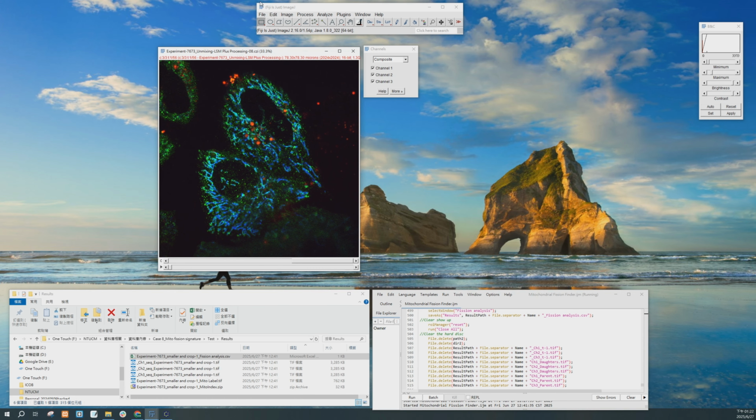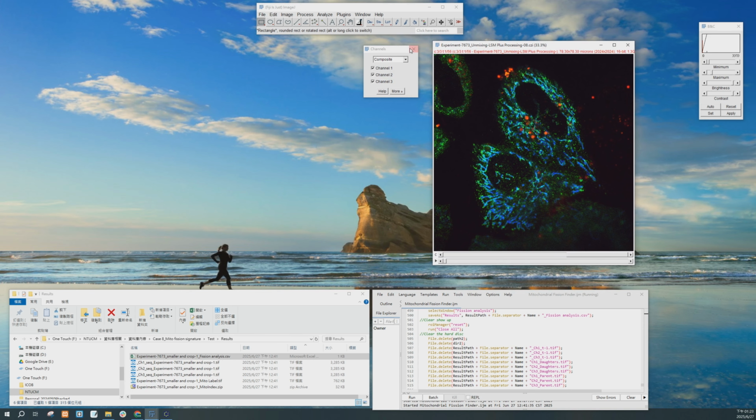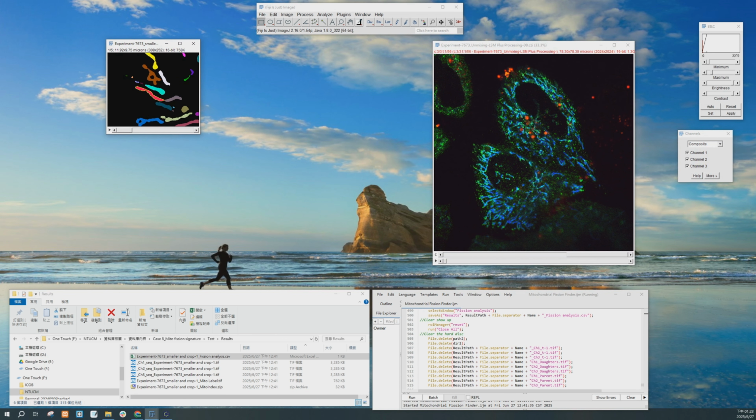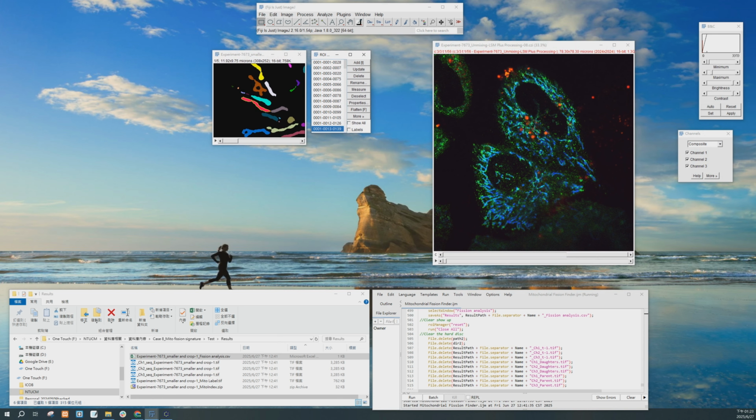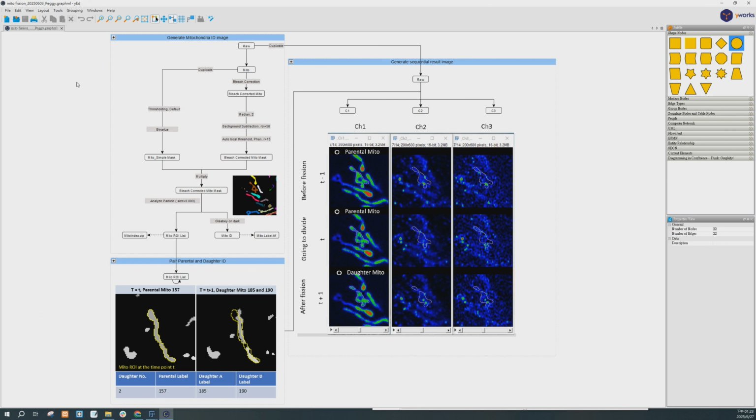Alright, let me explain first. After this macro is executed, what will we see? Firstly, as we mentioned earlier, our images tend to fade over time, becoming gradually weaker. So, in our real data, we will first extract the mitochondria from the first channel. After taking out the stained sample, you then proceed with bleach correction, so that all the images along the time axis have a consistent brightness.